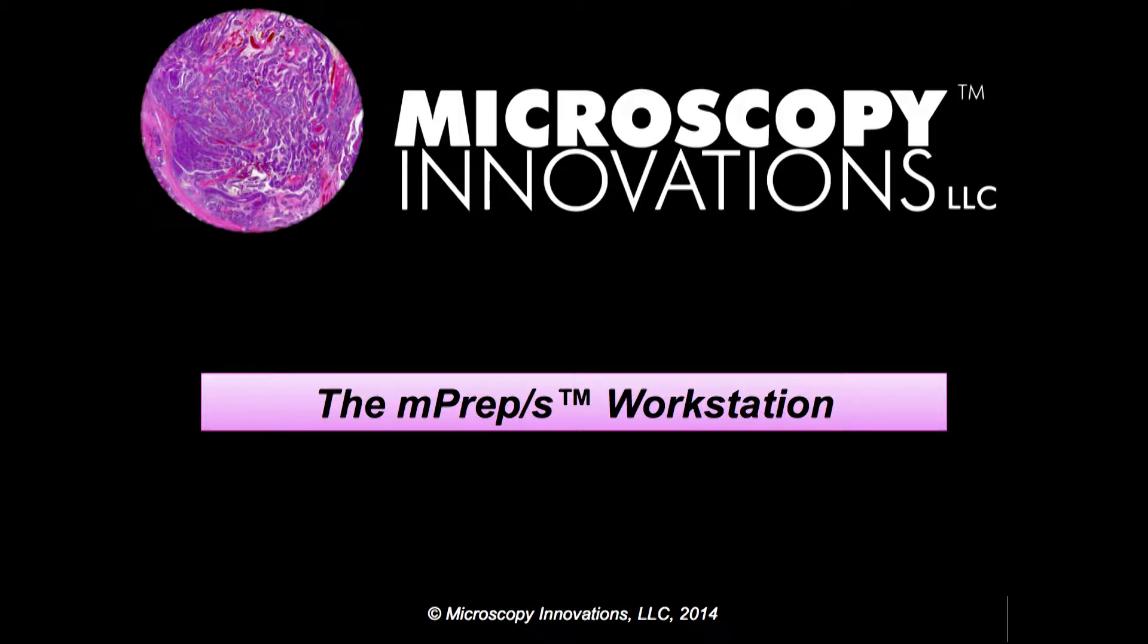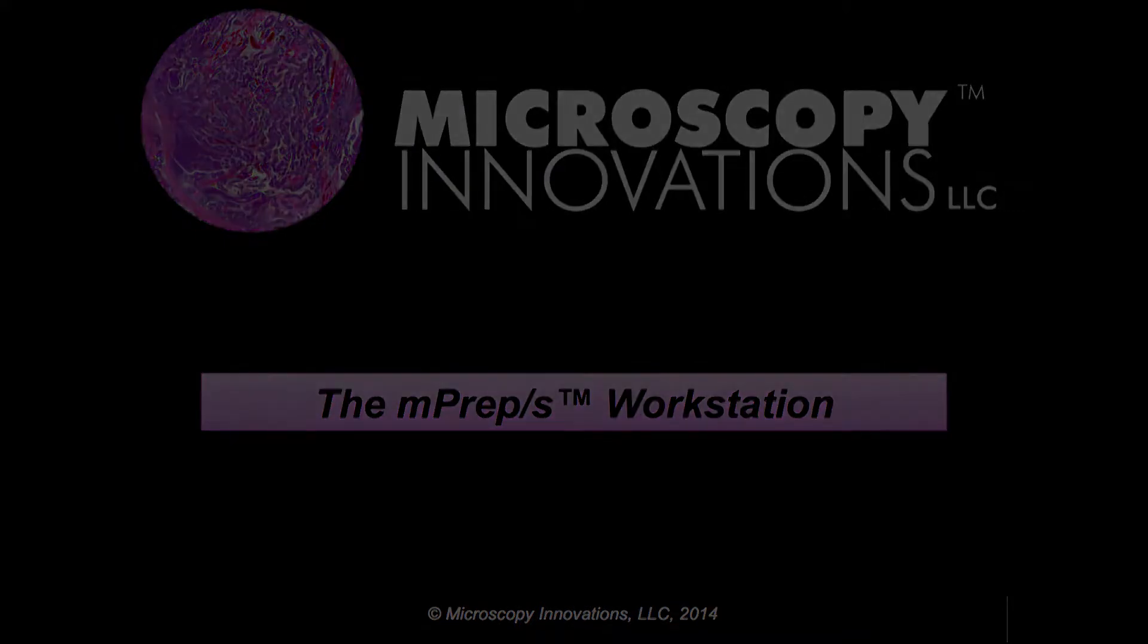Welcome to the MPREP Workstation instructional video. This video will show how the MPREP Workstation is used to easily and accurately orient different types of specimens and load them into MPREP-S capsules.